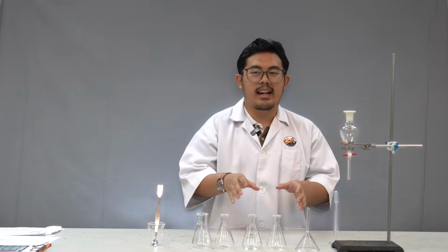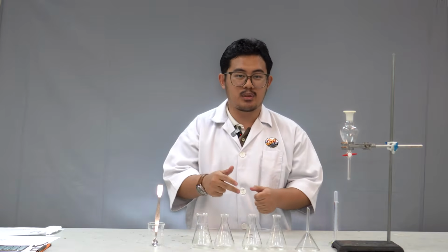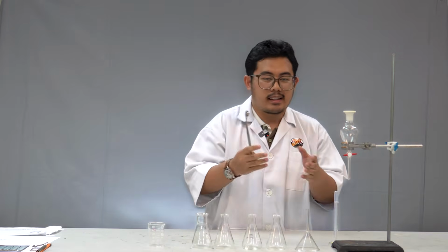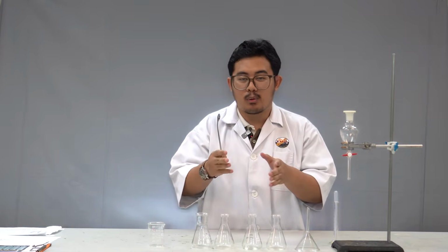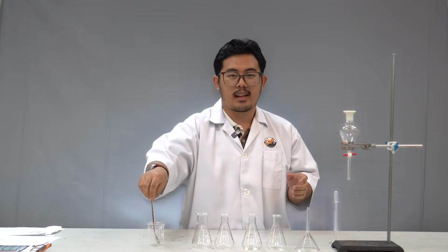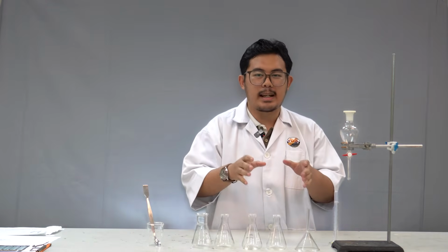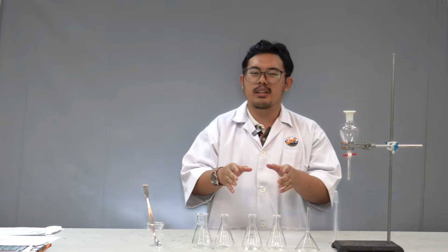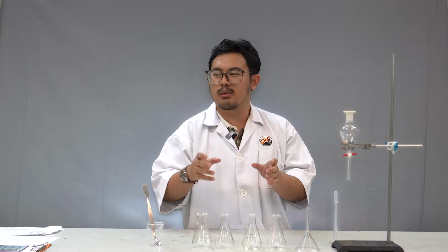So for the starting point, we need to add 0.2 grams of acid, base, and neutral using a spatula. And obviously from the substance preparation section, we had set measurements into one conical flask. So these are in a solid form. But for this experiment, we need them to be in liquid form. So how do we dissolve these substances into liquid form?